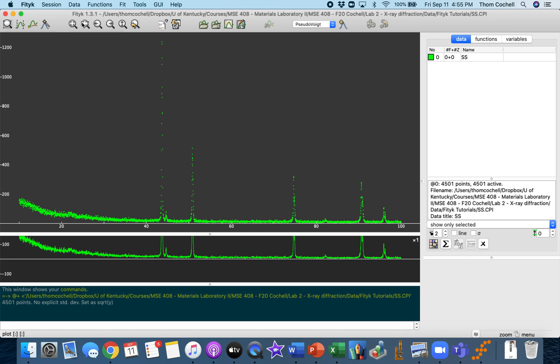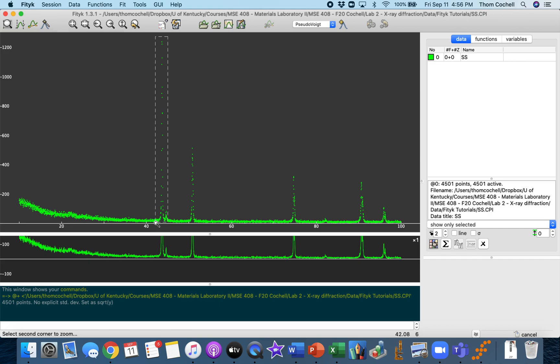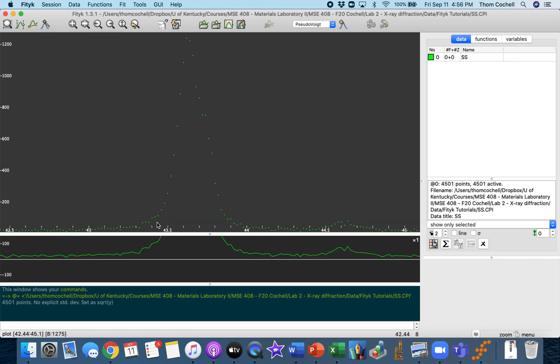You can hit this button which shows you the whole curve — everything collected from the XRD. For example, if I go back and click and drag, I just want to see this first peak. With Excel, you have to mess around with the window constraints, which is kind of annoying. So this is a lot easier.